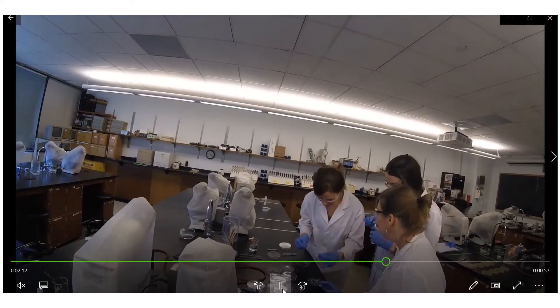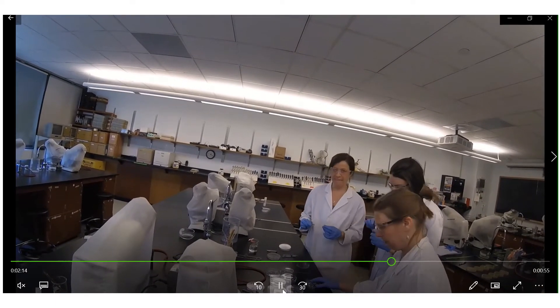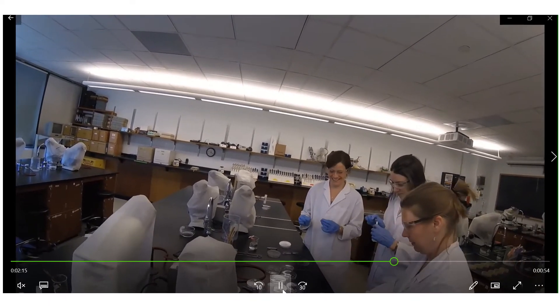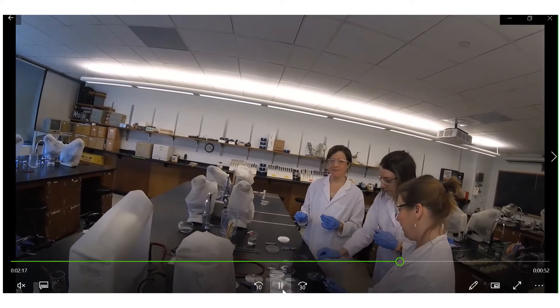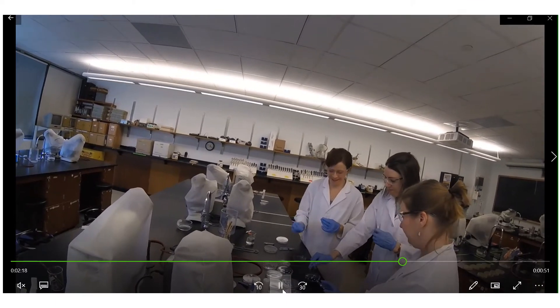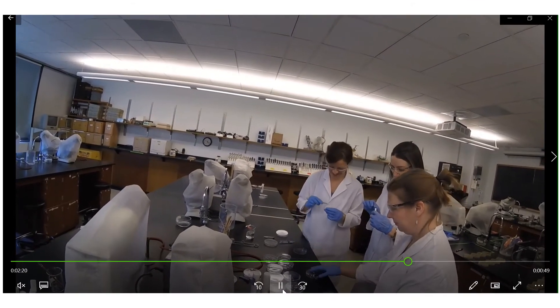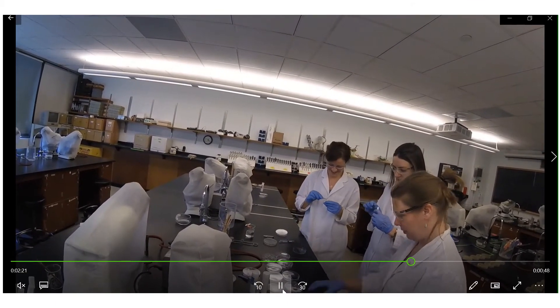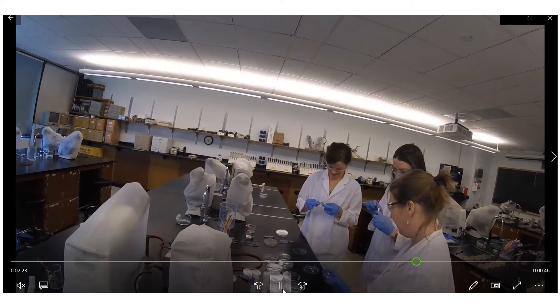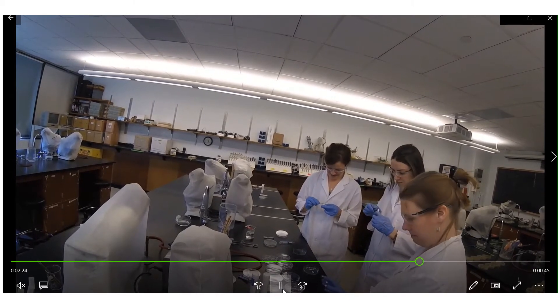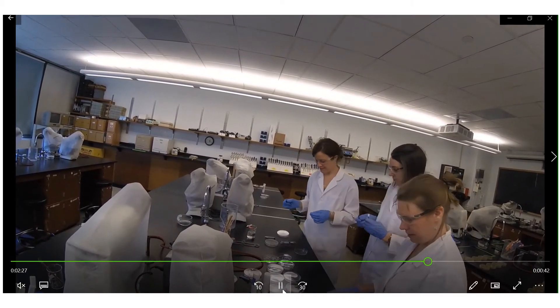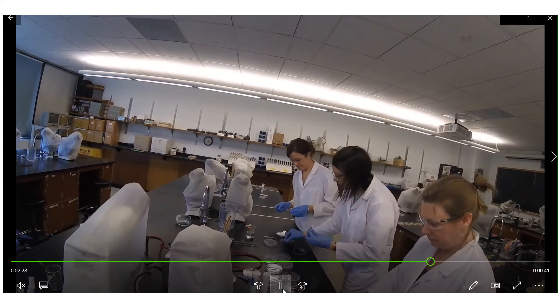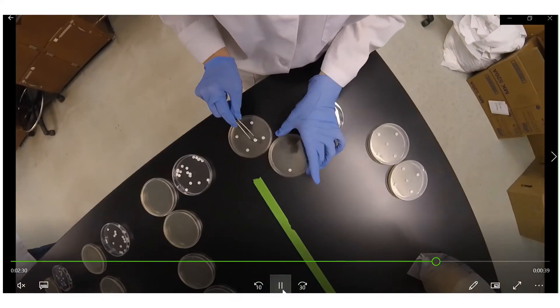Next we want to gather our 18 antibiotic discs and two sterile control discs. So Dr. Larson, Dr. Miller, and Claire are sorting these discs so each microbe has a collection of 18 separate antibiotics.